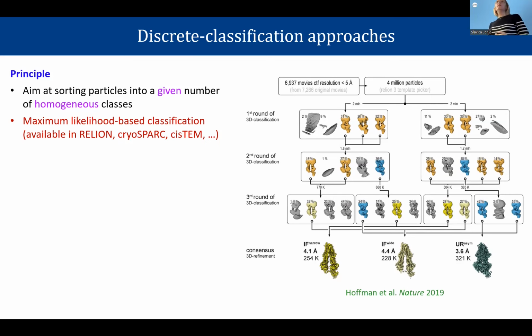And it is true that you can always get something if you say 3 classes. The point is that you know what you're doing, you know that you are mixing different shapes. So basically you will have anyway some shape that looks reasonable. It may be of a low resolution, but at the end of the day, you don't care when you're starting, because you want to get some shape.